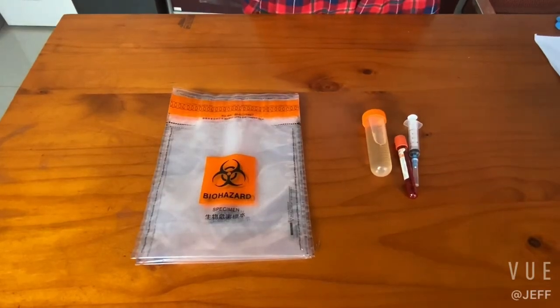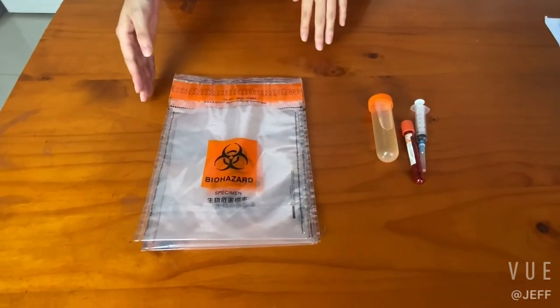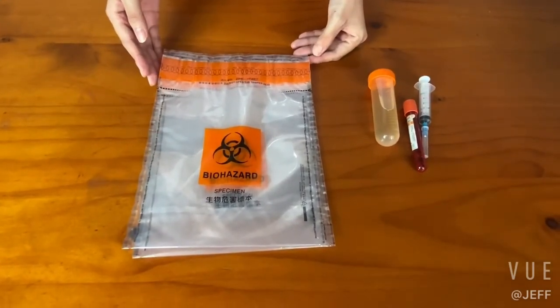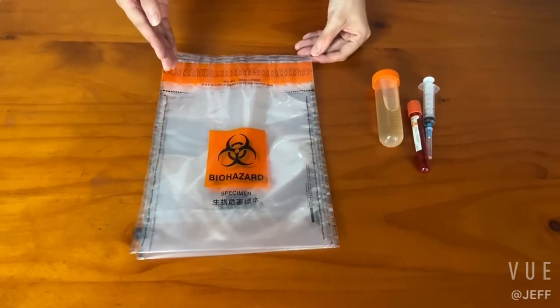Hello, this is Jeff Packaging Ltd. Today, I will introduce the Biohazardous Specimen Bag for you. It's an ideal choice for safely transferring potentially biohazardous materials to laboratories.